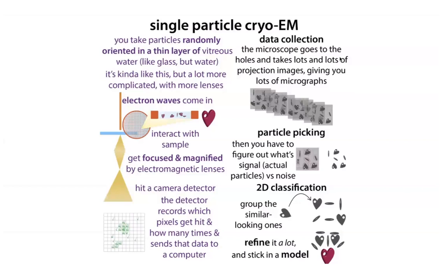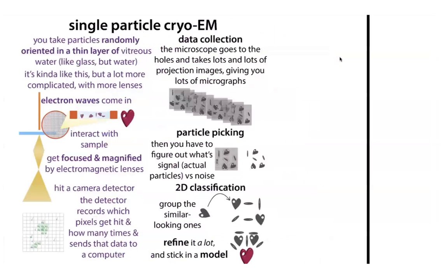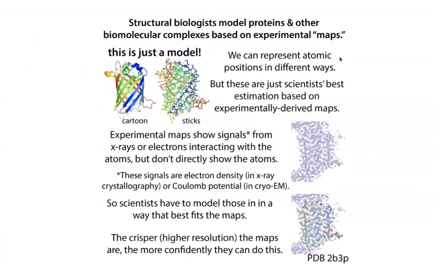So basically with cryo-EM, there are ways to see different conformations of molecules, as well as being able to average together all of those different orientations of the same conformation. Bottom line, you need a lot of data. You average them all together and you can get a structure. But it's not as easy as it sounds.